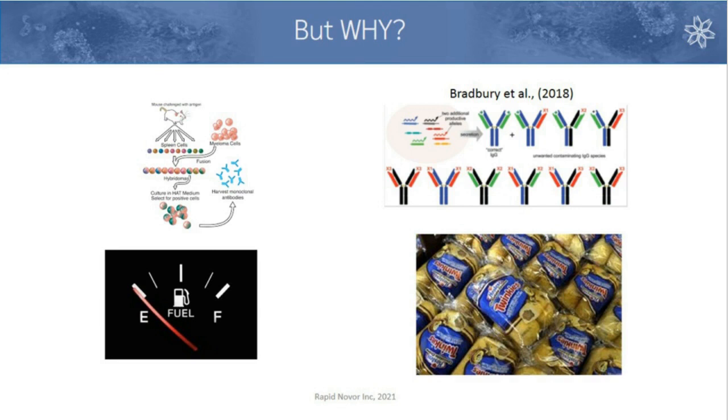But of course, there's real interest in that, and they come down to usually these main topics. So, firstly, if you have the hybridoma and it's producing your antibody just fine and everything's coming along, then obviously you're probably in a good case. You don't necessarily need to work with us.